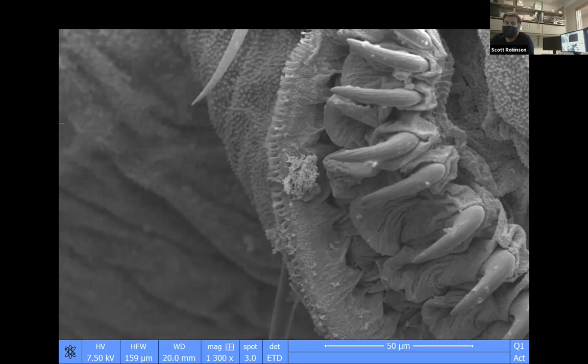This is about a $400,000 electron microscope. And the scanning transmission electron microscope that we have, when it was new, would probably be $1.2 million. So these microscopes have their own rooms. They have their own chilled water, their own air pressure, their own electricity. They have water that goes through them, air that goes through them, and nitrogen that goes through them. All of these things are really complicated. And it's all so that you can see something that's really small and get really good images of it. And it's super, super fun.